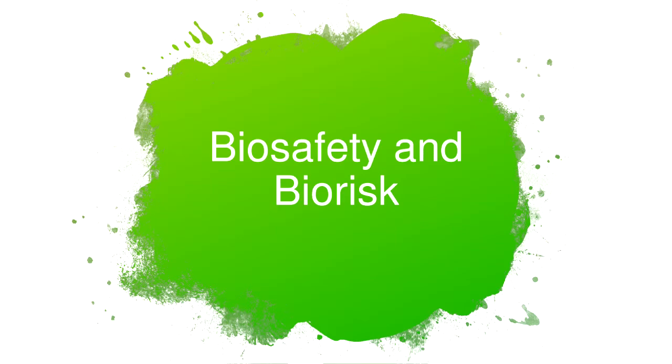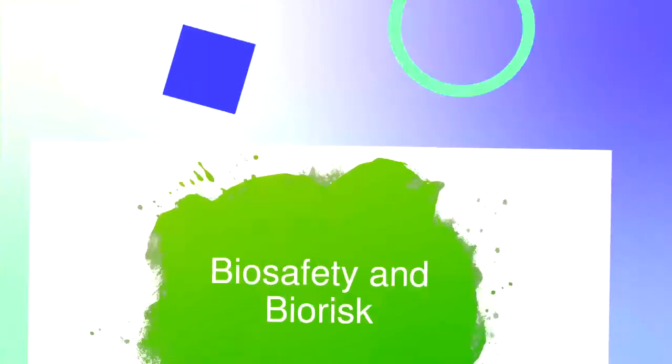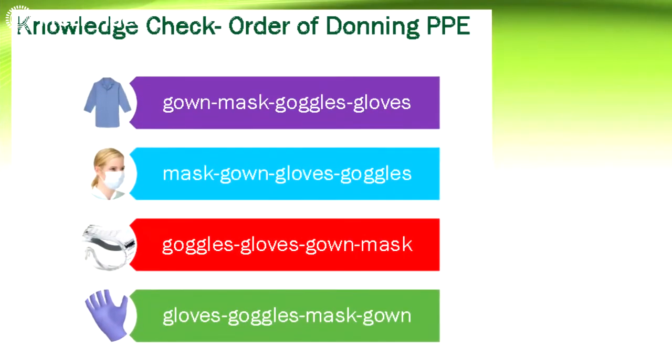Now, for this week, we have Biosafety and Biorisk. So, pagdating sa biosafety, importante dyan ng proper way of wearing your PPE or what you call the donning. Kapag donning, sinusuot mo yung PPE. So, ano ba yung proper order of donning the PPE? So, first you have the gown, followed by the mask, the goggles, and the gloves. Yung gloves yung pinakahuli mong sinusuot.